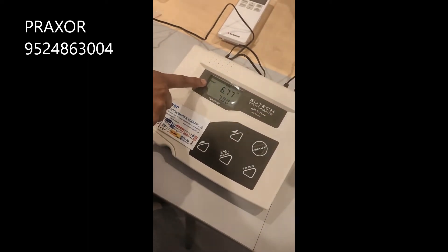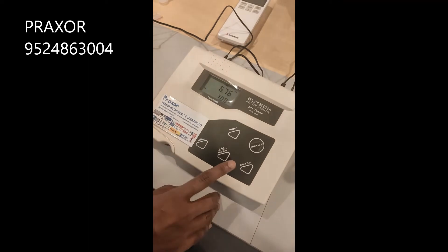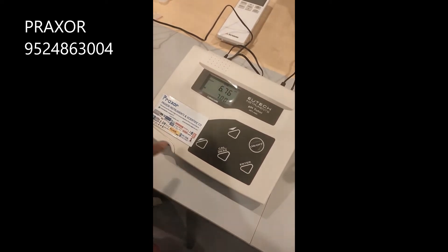Once the calibration is done, the ready signal will appear in the corner of the display. After that, just press the Enter key.